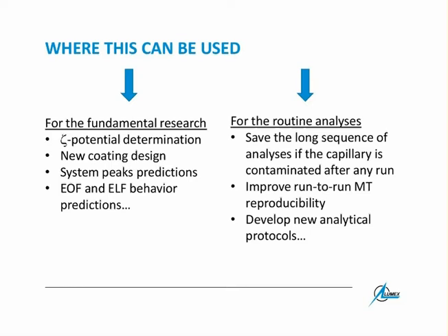Another question pops out, is it possible to measure streaming potential in coated capillaries? Yeah, but in coated capillaries, if electroosmotic flow is eliminated, streaming potential is equal to 0. So you measure that it is 0. It is also very interesting for university research, for example, because people try to design a special capillary coating, and they do not know whether this coating works perfectly or not. Means they do not know whether it eliminates electroosmotic flow completely or not.